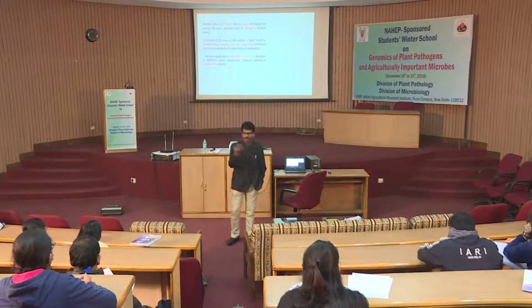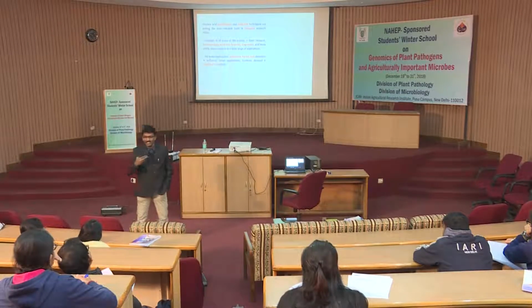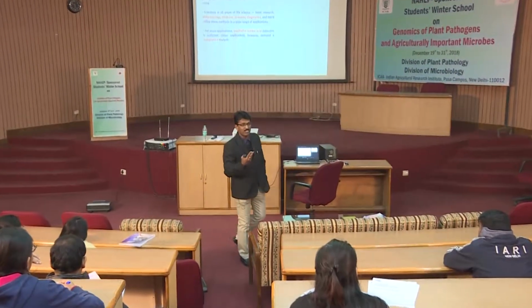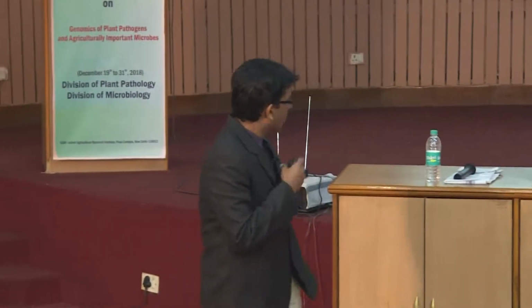I hope all of you understand by making a statement amplicon. Amplicon means the multiplied fragment, right. This is a jargon, amplicon, the product which is coming after amplification. So, now the qualitative nucleic acid detection is sufficient in most of the cases, right.